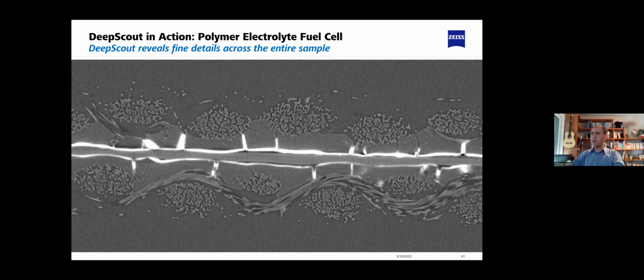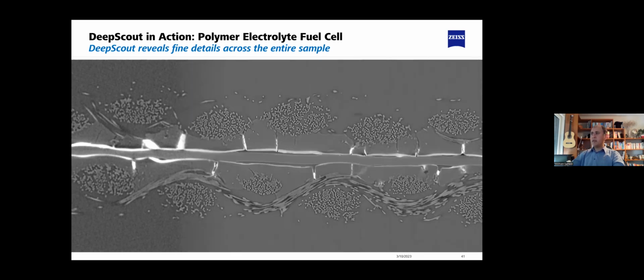What you are seeing here now is a composite material, perhaps with a lower objective, covering a large region of interest. Perhaps it's always nice to have the high resolution in some part of it, but if we are having it across the whole, it is in fact changing a lot the available statistics in terms of sample characterization. And this is what happens if we are using the AI to improve the resolution of a large field of view scan.